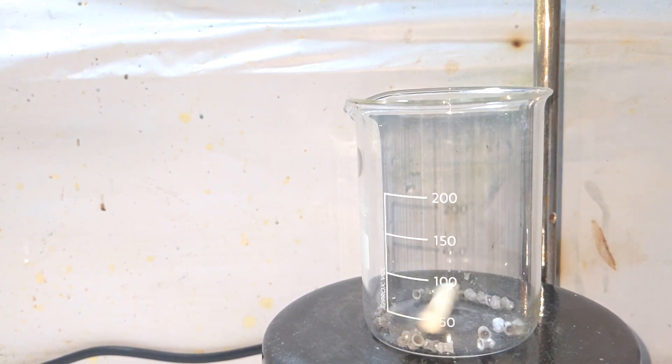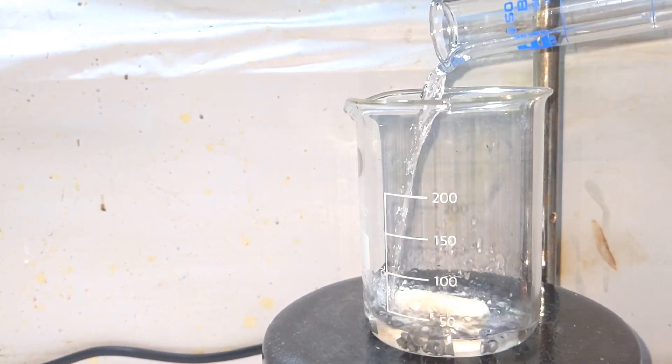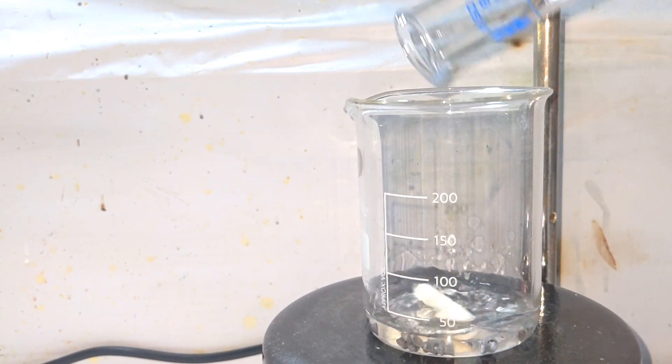Here I have taken 10 grams of lead metal shots in this 250 milliliter beaker. It's placed on a magnetic stirrer with stirring on. Into that was added 25 milliliters of glacial acetic acid.